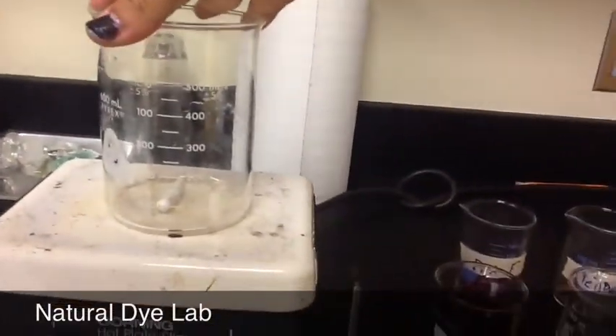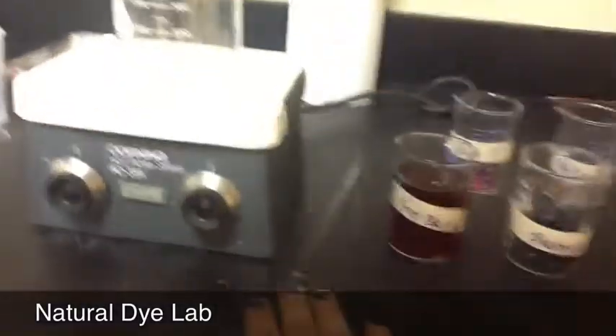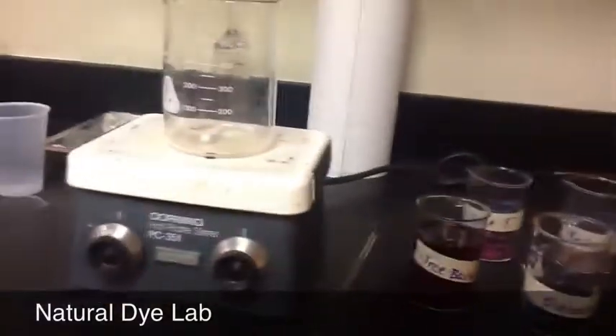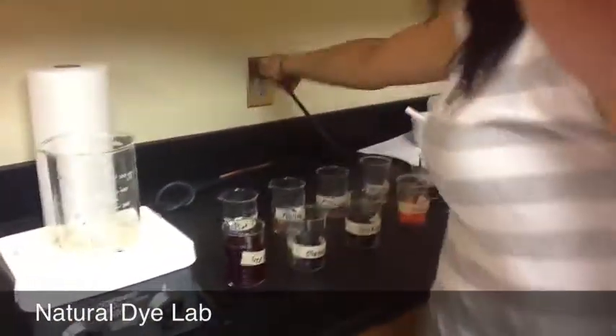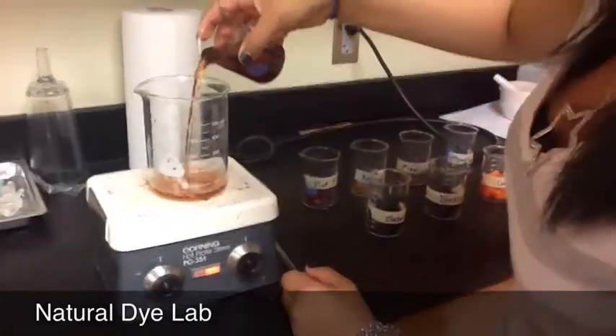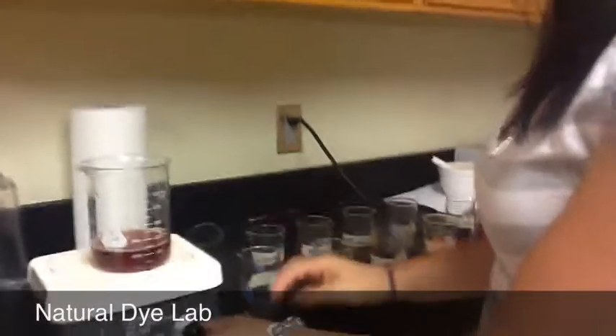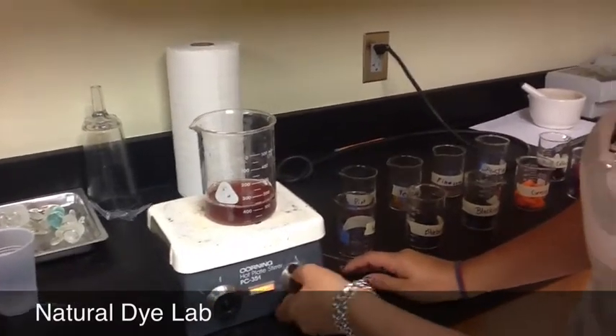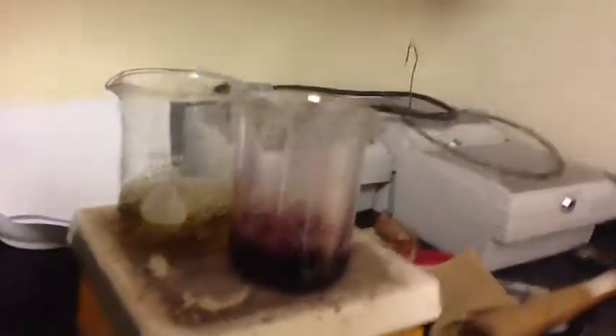What we do is we will be putting our ingredients in a beaker of water with 250 milliliters and put it on a hot plate and stir occasionally until the object changes the water. Then we have to boil it off again to turn it into a dye, and we have to let it sit and take out the fabric from purple.